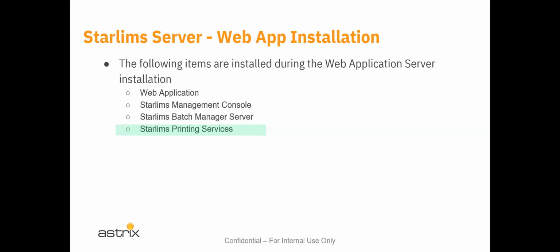Additionally, not so much hardware printing these days, because most instruments are outputting PDF and electronic soft forms for printing and reporting. But there are instances where a printer does need to operate, and so we'd actually install a print server type application service.